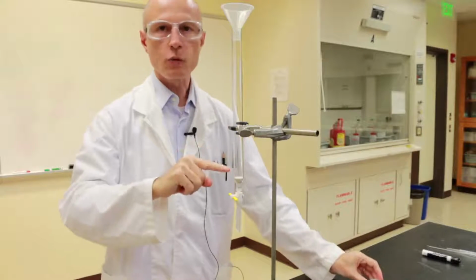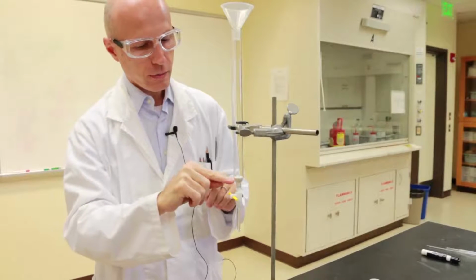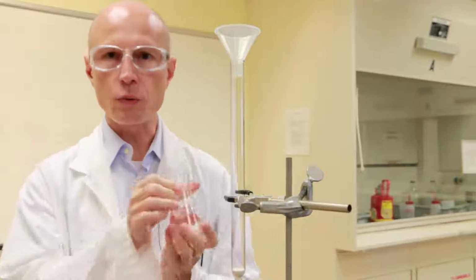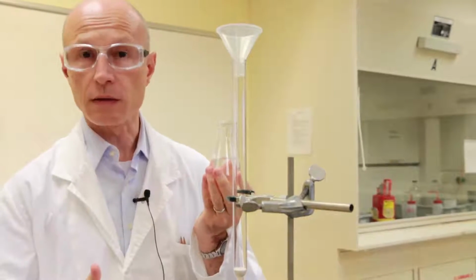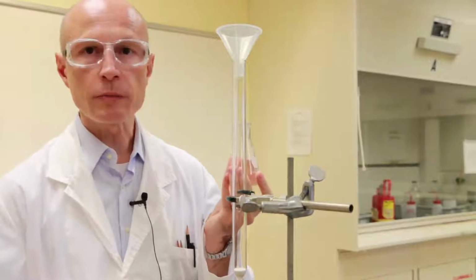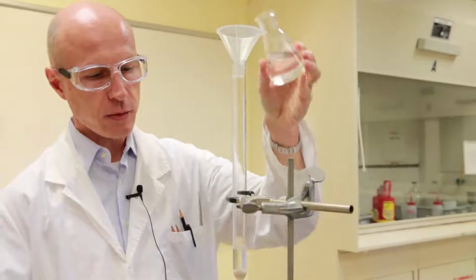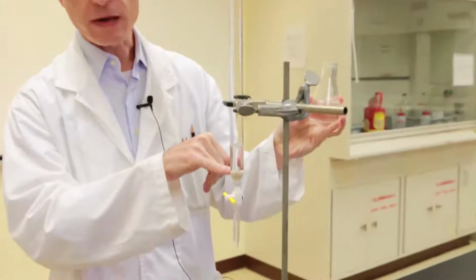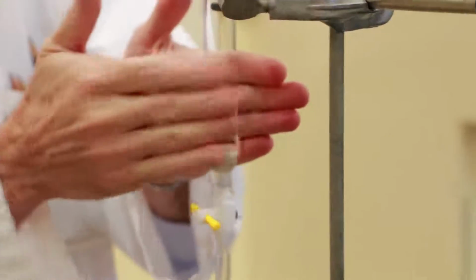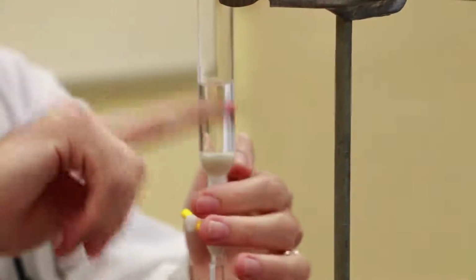The silica gel column must be a perfect cylinder, so you want to put in enough sand to go past any curvature in the side of the column. The solvent that you are going to use in order to pack the column is the solvent that you will use to run the column. So it's going to be a mixture of hexanes ethyl acetate that you already determined by TLC. So you start by pouring a little bit of your mixture on top of the sand, and if you see, there's some air coming up. Then you tap the sides of the column to make sure the sand is perfectly flat.